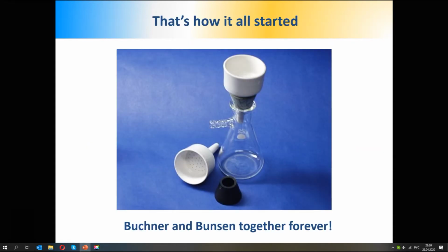So let's start from the filtration, which is a pretty typical application in a lab. So that's how it all started. I've read in Wikipedia, as far as I remember, it started something like 150 years ago when Buchner and Bunsen developed their funnel and the flask, and so they stayed together after that for more than 150 years, and something tells me that they will stay together forever and ever till the end of times.